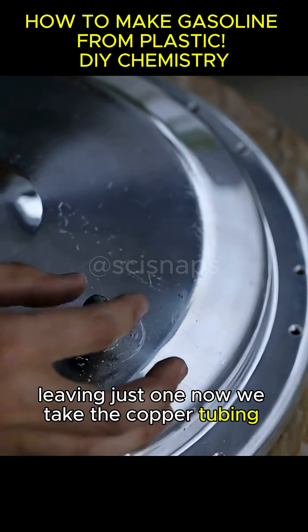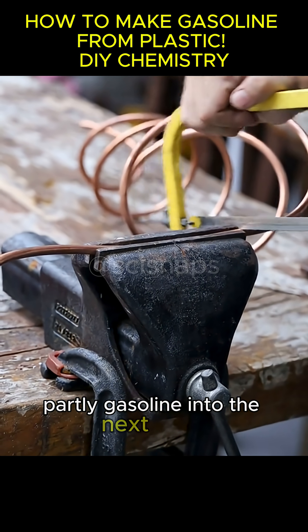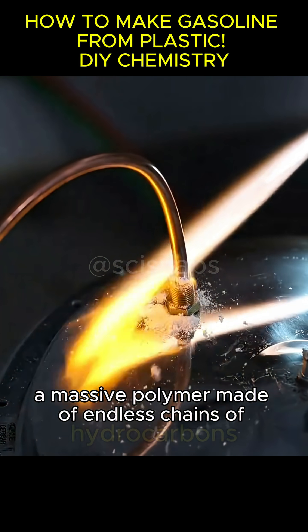Now we take the copper tubing and cut a section. This will carry hydrocarbon vapor, partly gasoline, into the next stage. The plastic bags are basically polyethylene, a massive polymer made of endless chains of hydrocarbons.